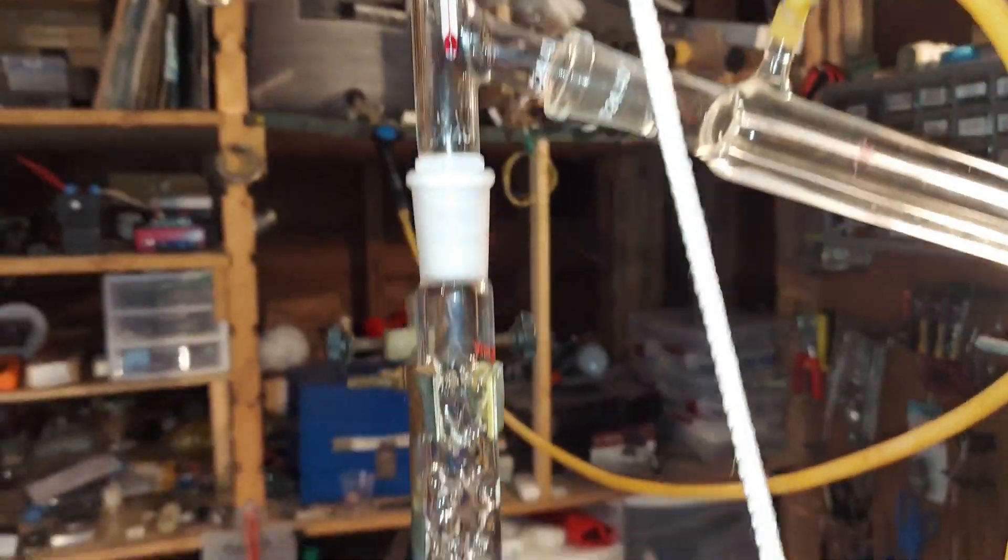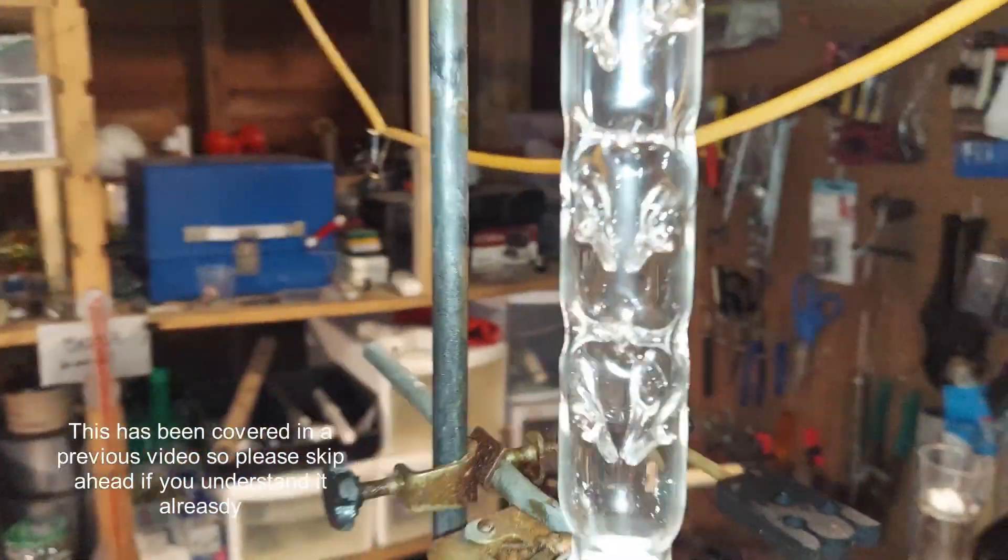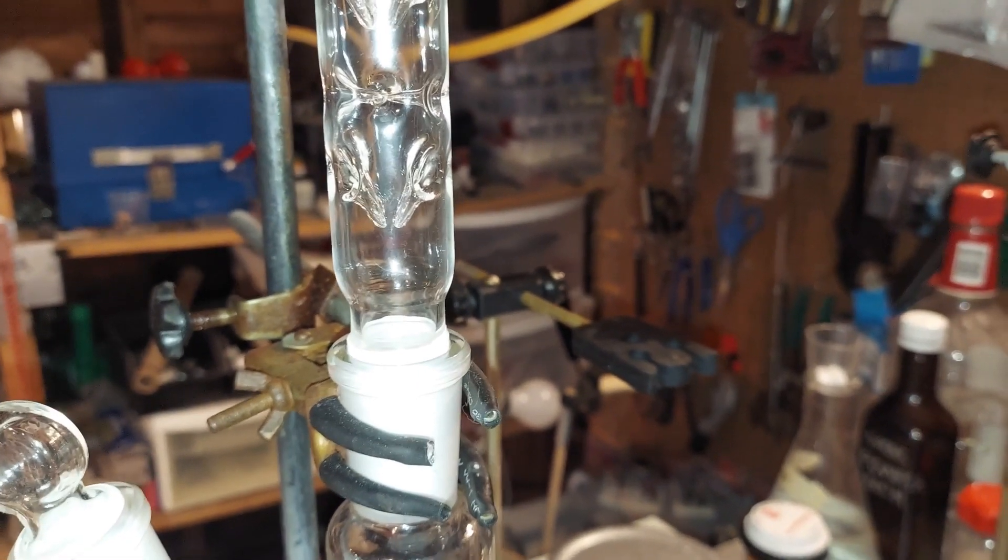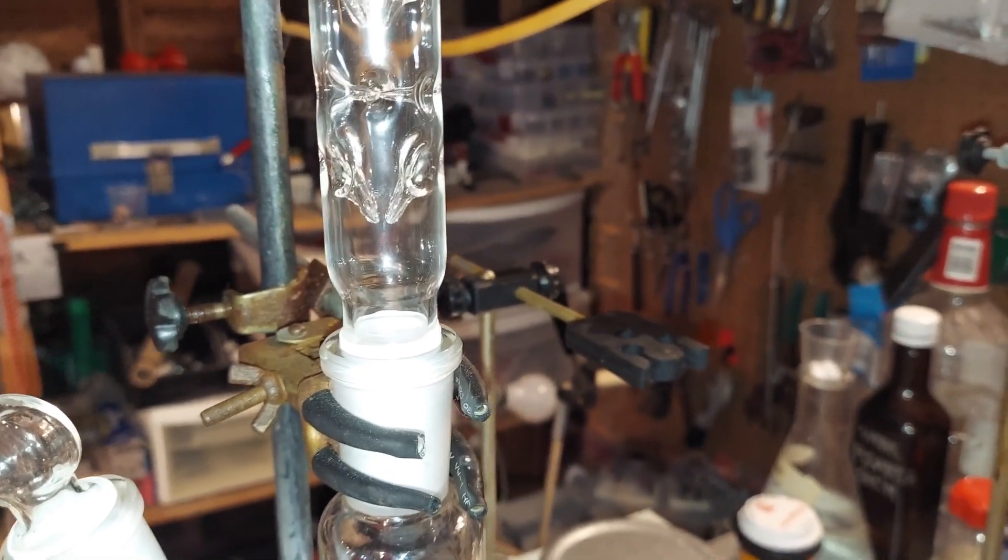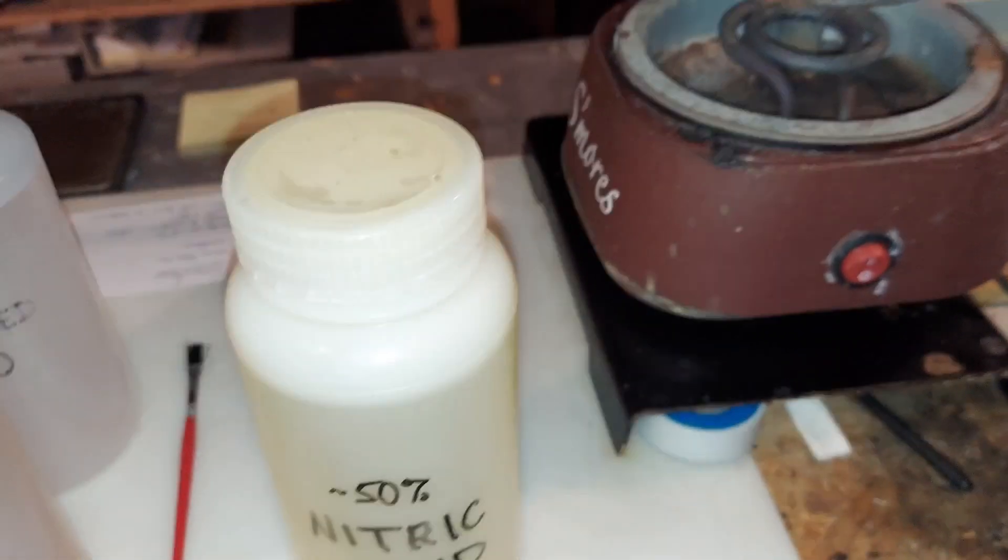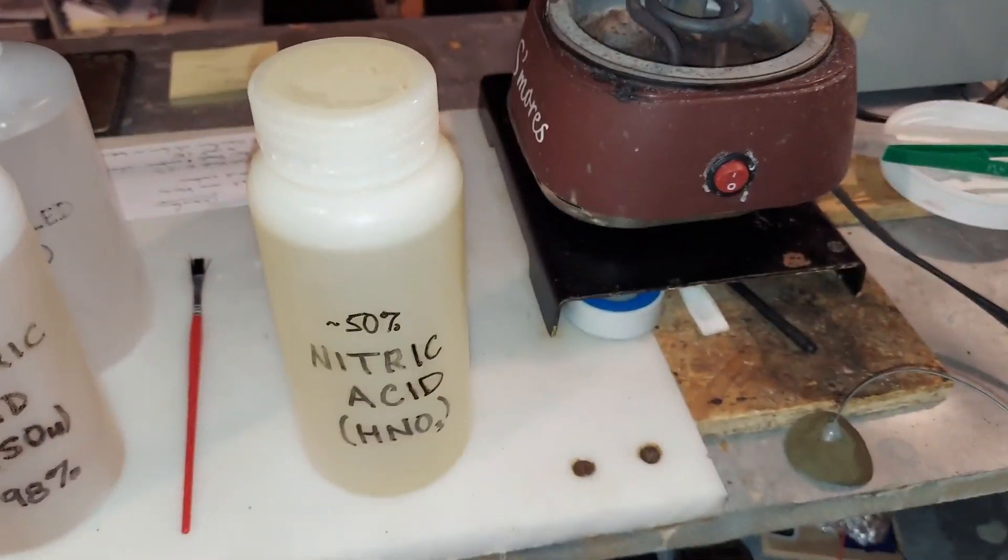This column right here is where it fractionates. What's fractionating with the nitric acid is the actual pure nitric acid and the water that's mixed in it to make it 50%.